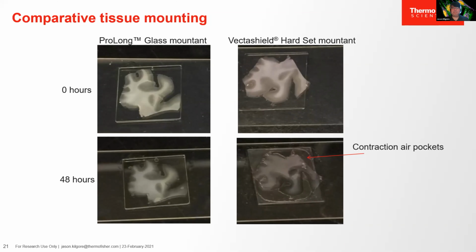That's okay. I'm going to do one more question before we move on, but there are several more questions in the chat if you want to take a look at them. Has Prolong Live been tested in bacterial cells? No, as far as I know, we've only tested them on eukaryotic cell lines. My expectation is it would work pretty well for bacteria too, because it's basically sopping up the ROS in the media outside the cells. So whatever your cell type, it'd probably be good for those too, but we have not tested it.